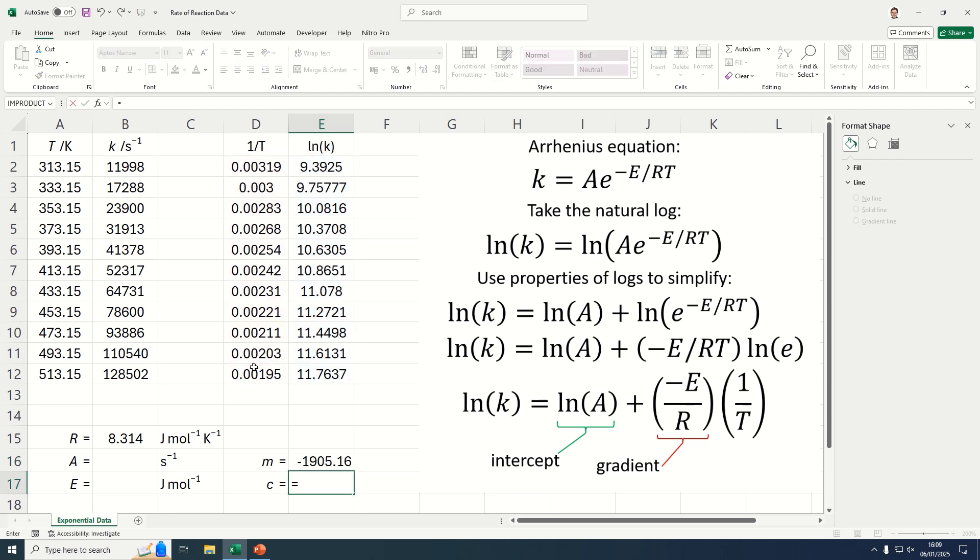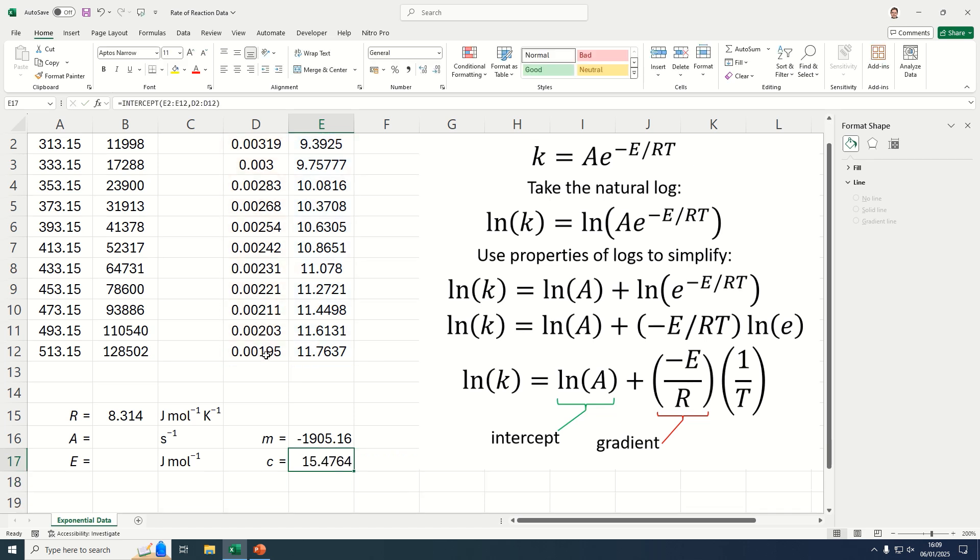And then we can also use INTERCEPT to get the C value. So y values, comma, x values, close the brackets, and there we have it.